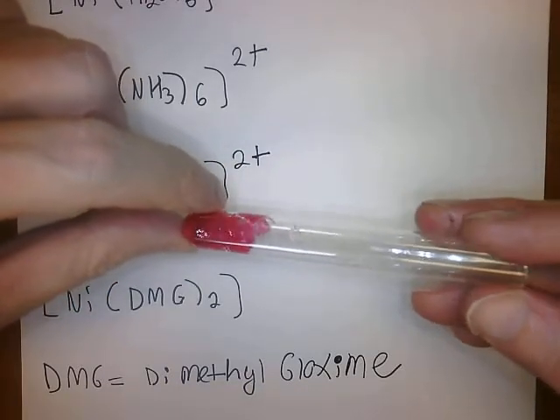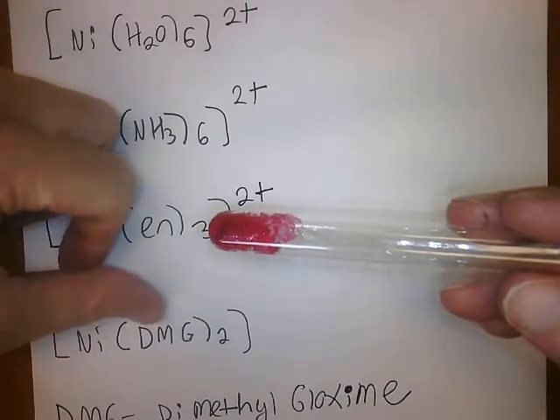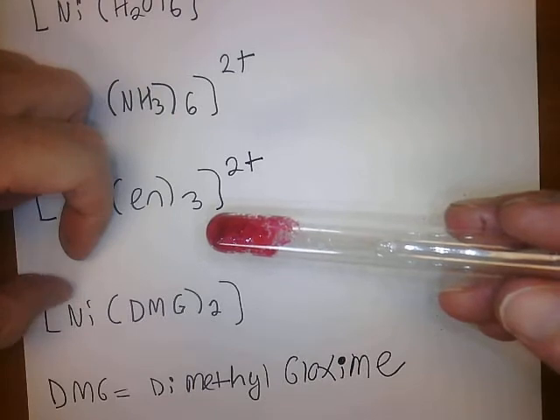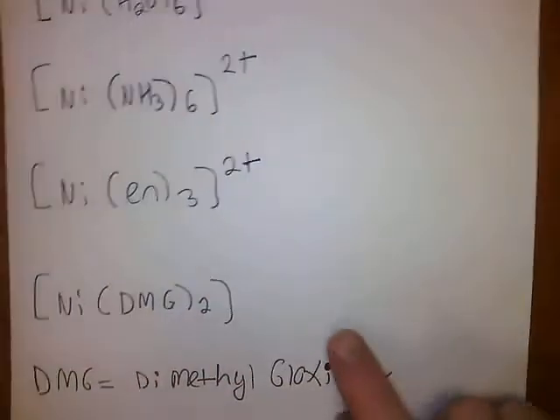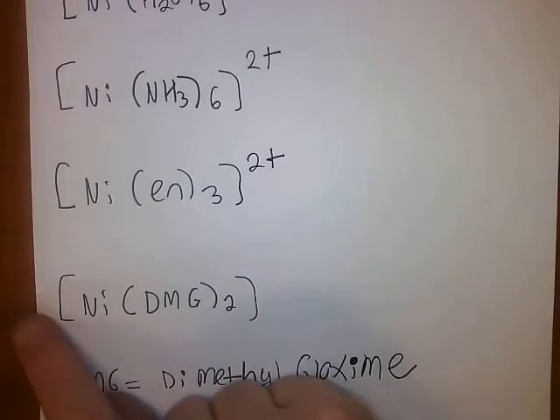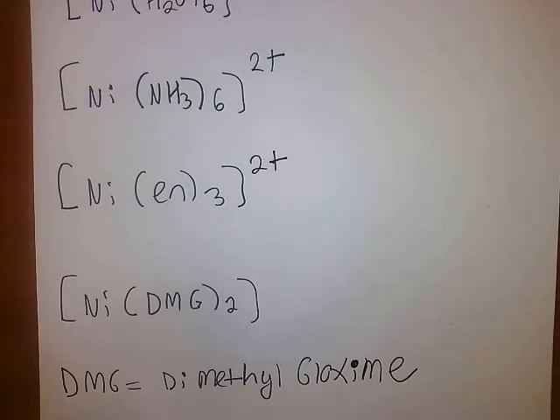So dimethylglyoxime is actually a 1- ion. It forms a square planar compound. Two of them coordinate to the nickel. The charge on the ligands balances the charge on the metal. Notice there's no charge out here, there's no charge here, and there's no counter ions in the front or the back. The charge on the ligands balances the charge on the metal. That's why it precipitates out.